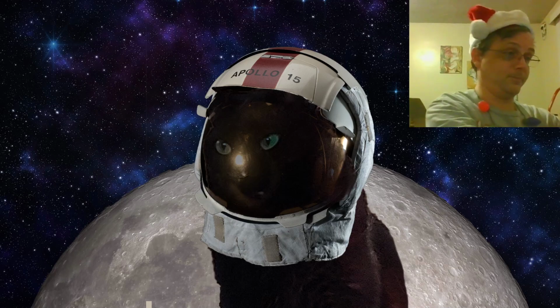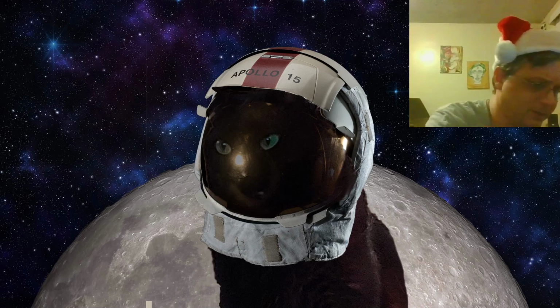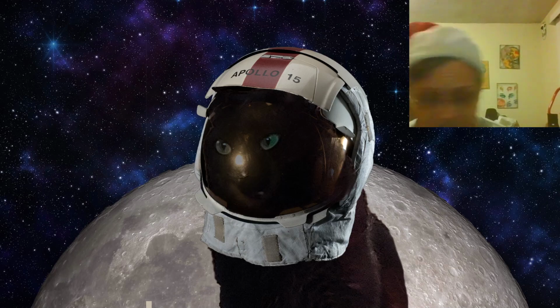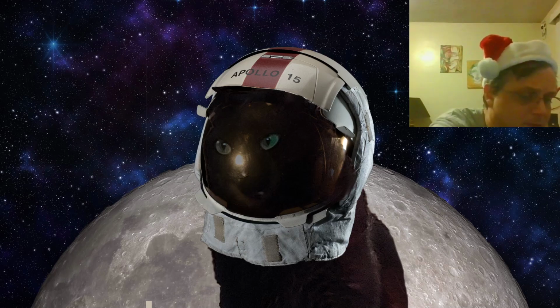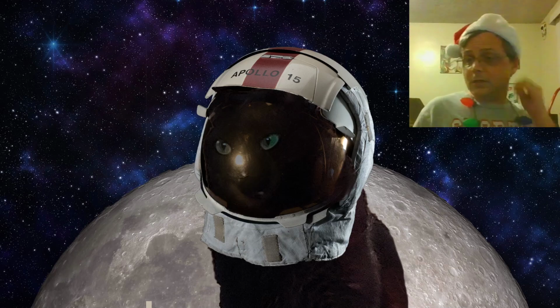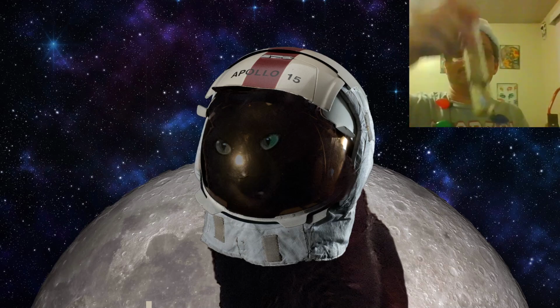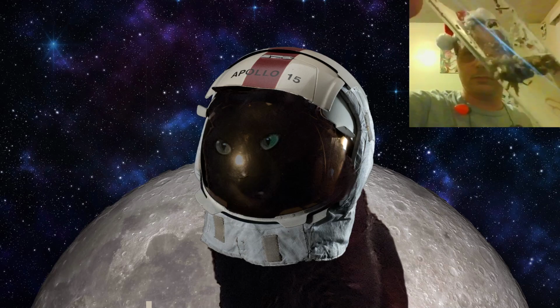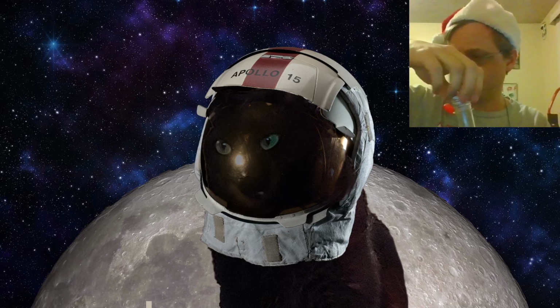Oh well. I'm gonna look at one more sample. This one I'm gonna try to grab from the top where there's a lot of floaty light things. Let me see if anything is in there. All these floaty things, which is where most of the moss or whatever that stuff is. Most of it was right there at the top here.